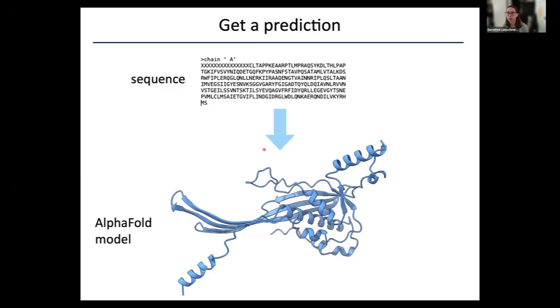Well, we talked a lot about these confidence measures. So just looking at the predicted structure is, I think, not enough. We have to look at the PLDDT, and here the PAE is not so informative because it's actually just one domain. But before that, generally, this is probably not such a hopeless case because we can see helices, we can see sheets, while there are some weird loops here and there, but generally this looks like what we expect a protein would look like.